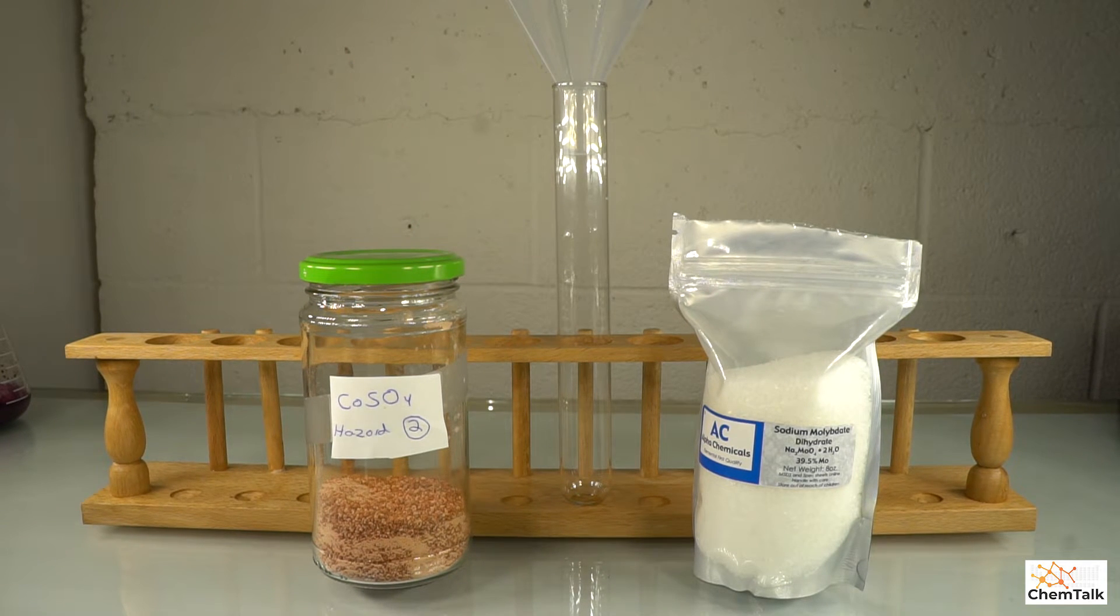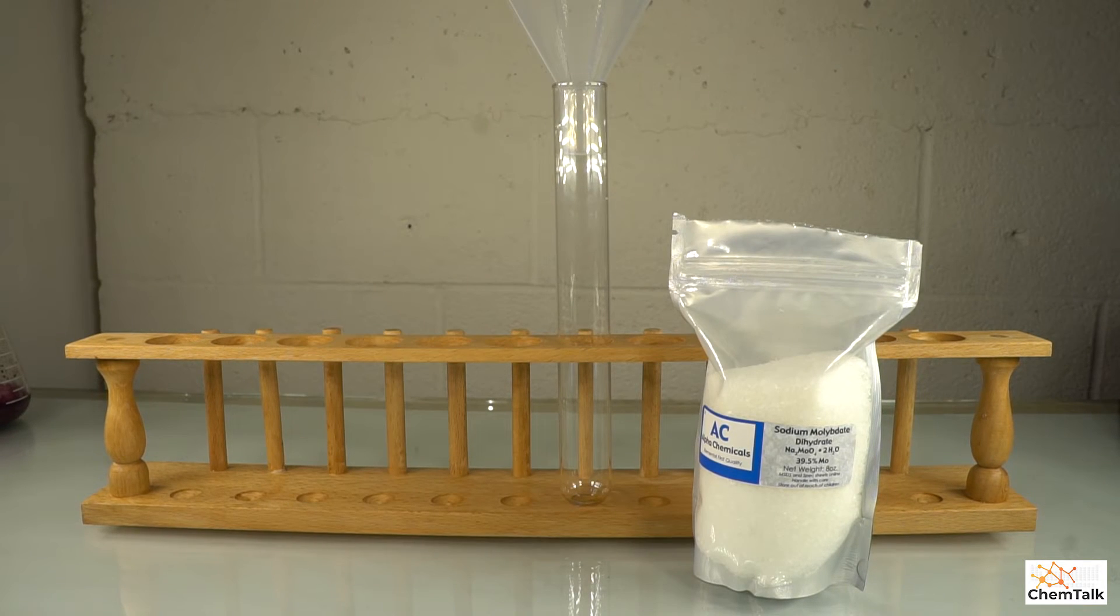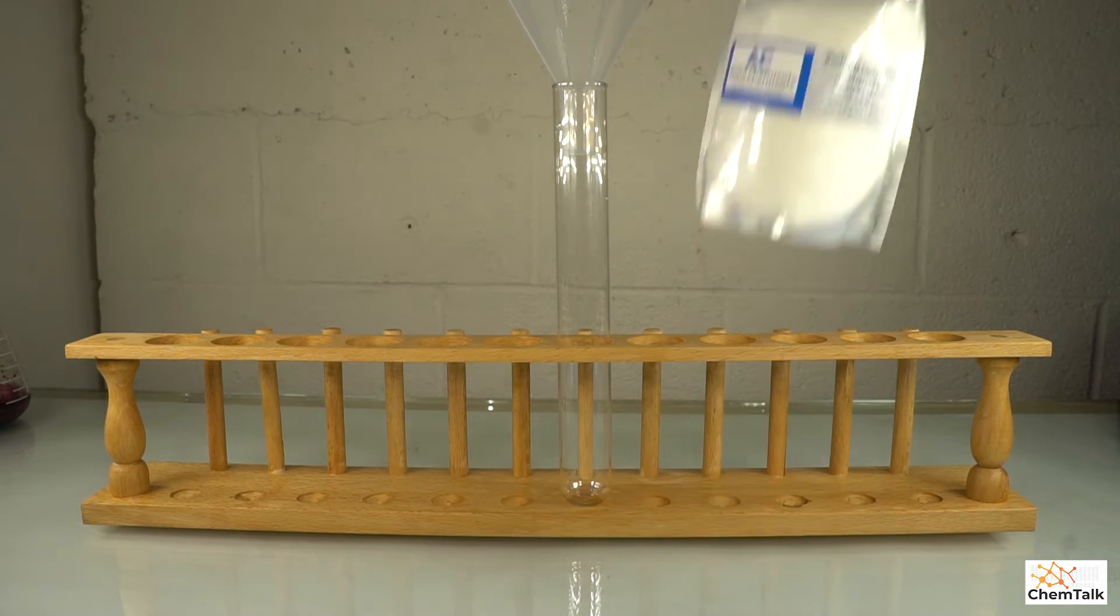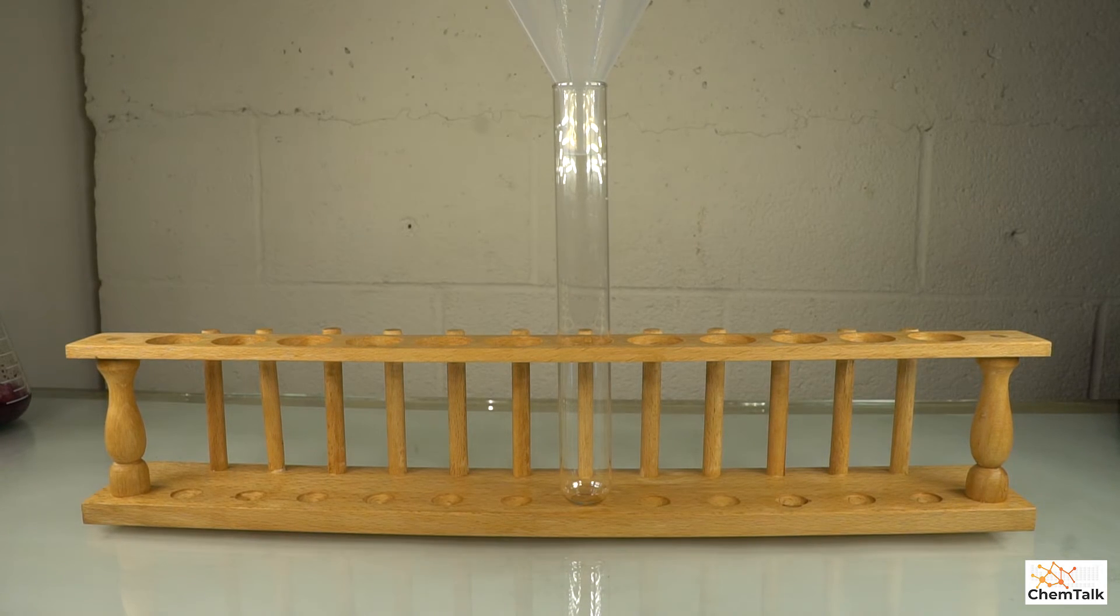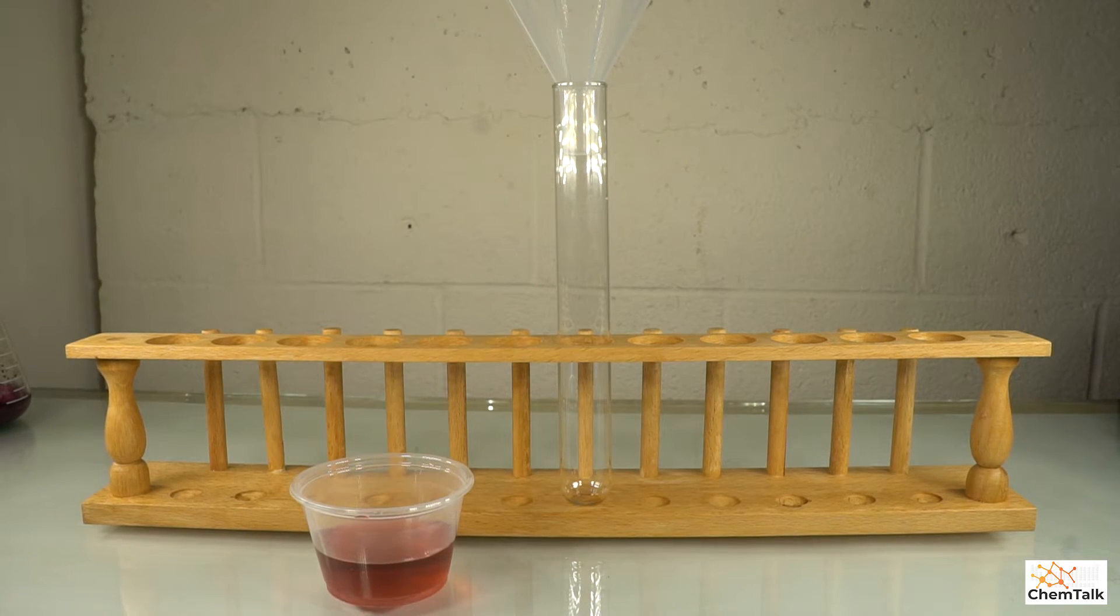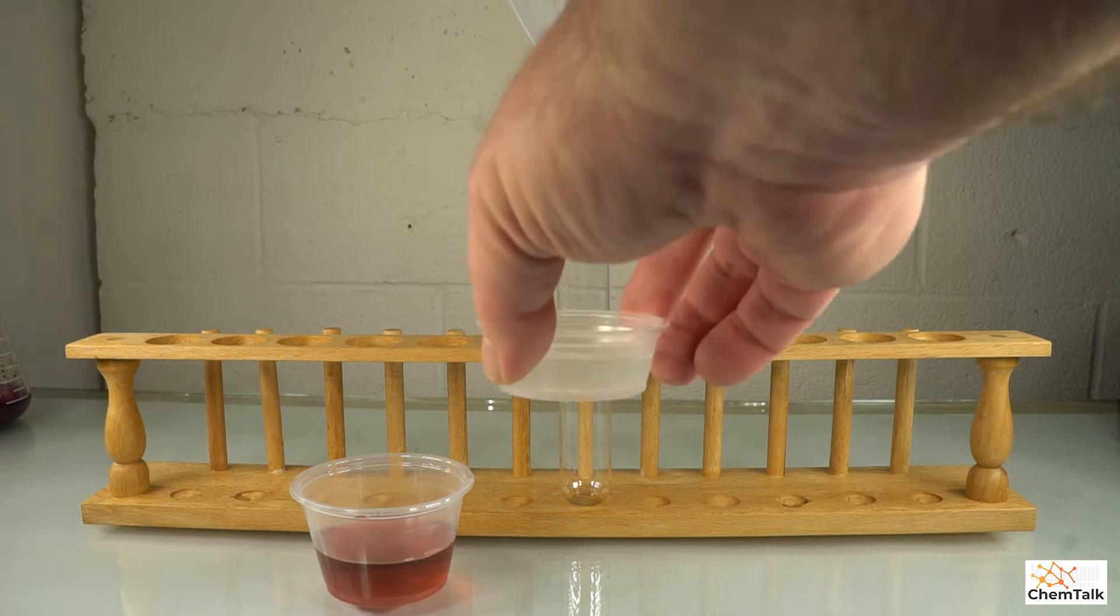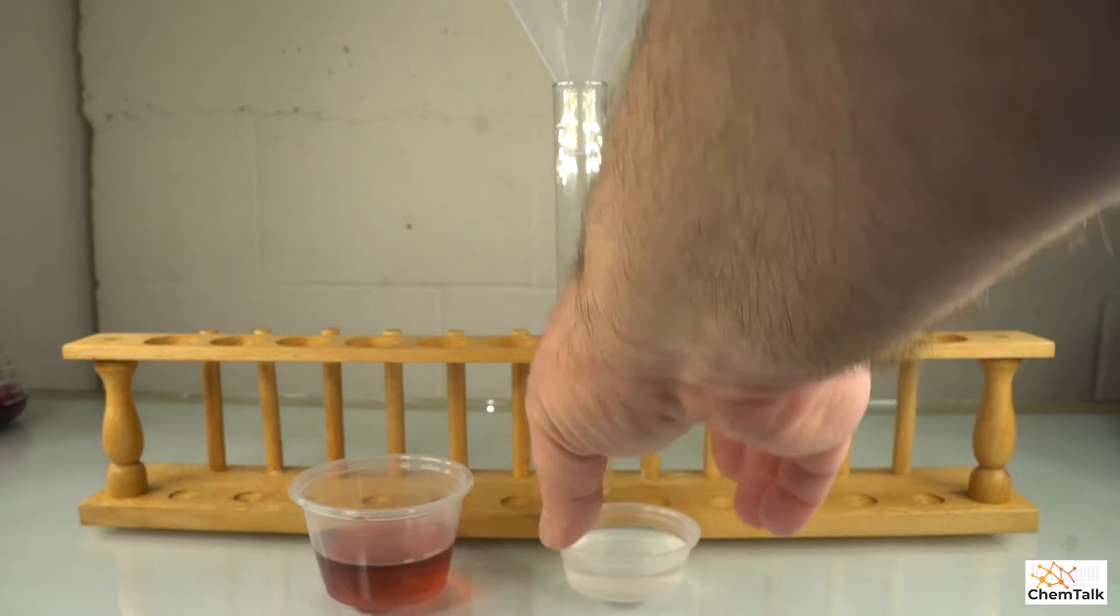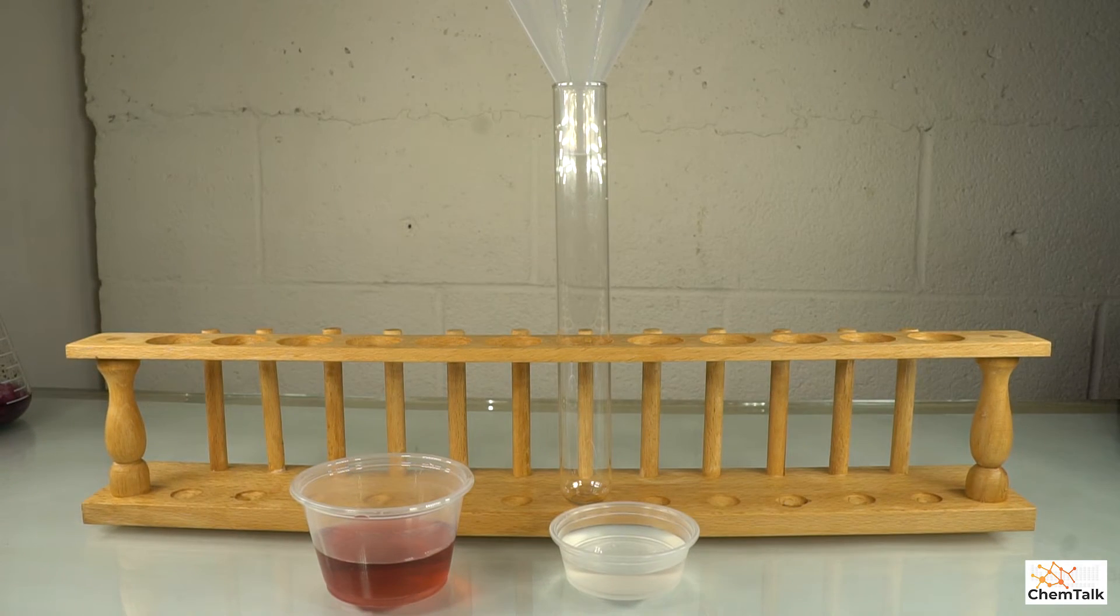So I'm going to move these out of the way, and I did the pleasure of pre-mixing some solutions. So in this clear container, I mixed four and a half grams of sodium molybdate with 20 milliliters of water.